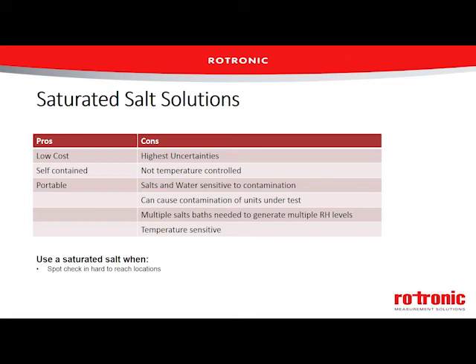Not only the salts and the water can get contaminated, but I think most people that have used one of these have probably contaminated their probes at one point or another. A little jostle of the salt bath or inserting a probe a little too deep, and suddenly you've got salt water on your sensor, which would then need to be cleaned off because it will cause shift in readings to most sensors, if not damaging them permanently. So you've got risk of contamination that way as well.